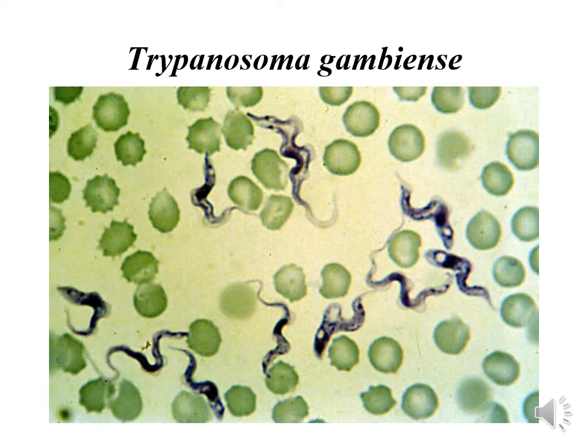Trypanosoma gambiense and Trypanosoma rhodesiense are morphologically indistinguishable, and both of them are extracellular parasites, and they look somewhat wavy. Of course, Trypanosoma cruzi is a little bit different, because in most fixed specimens it doesn't have this very wavy structure. It may assume an L or C-shaped structure with a comparatively large nucleus. During the multiplication of cruzi, some of them could be extracellular or intracellular.